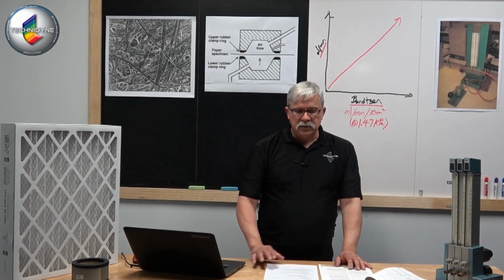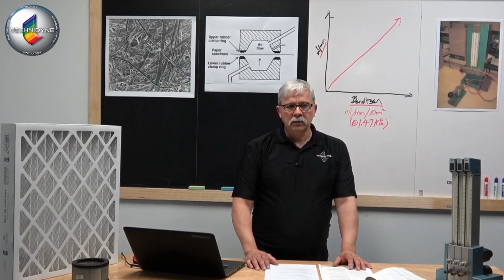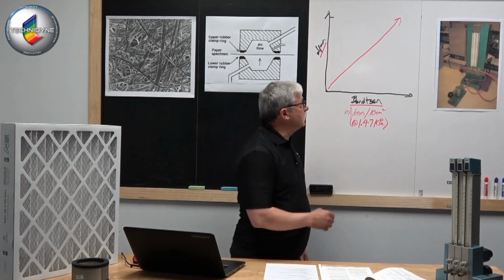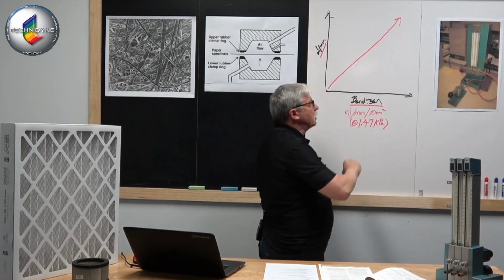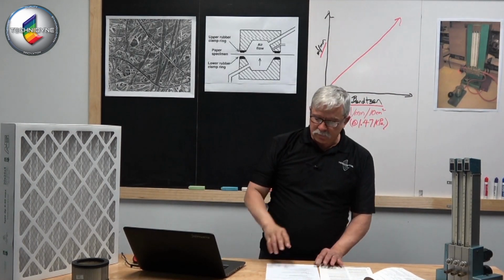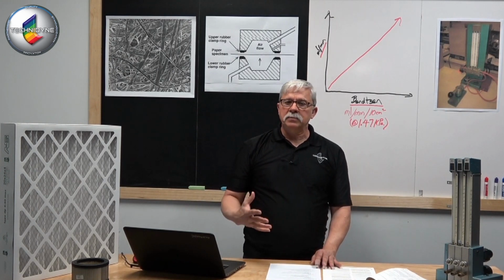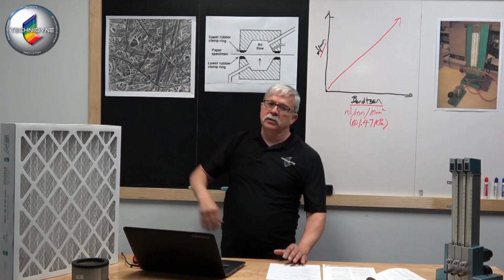The Bendtsen measurement is quite linear, and the relationship to standard cubic centimeters per minute is pretty intuitive, in that when the Bendtsen units are increasing, so is the flow through the sheet. If my measurement is going up, my web in my production is opening up.